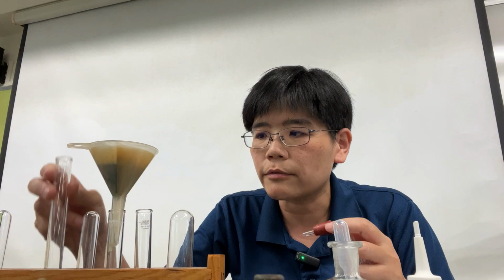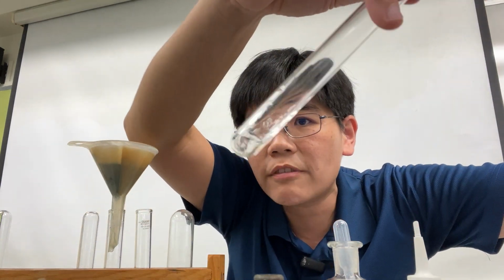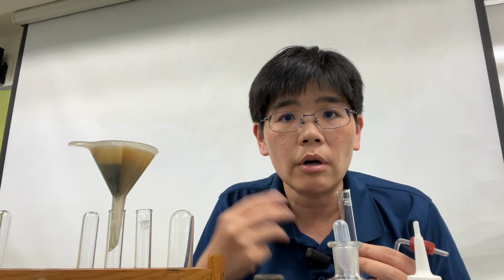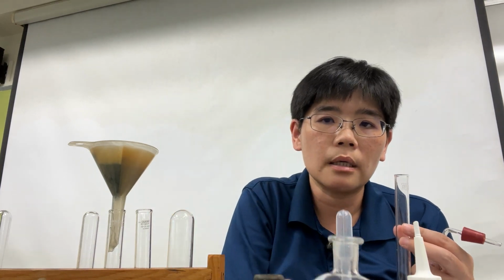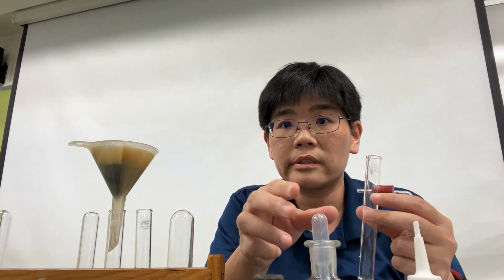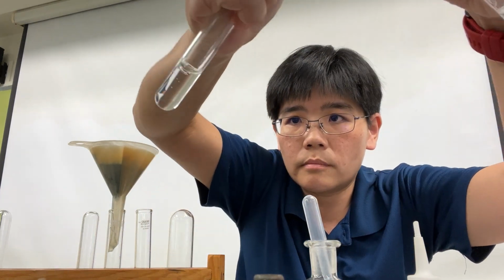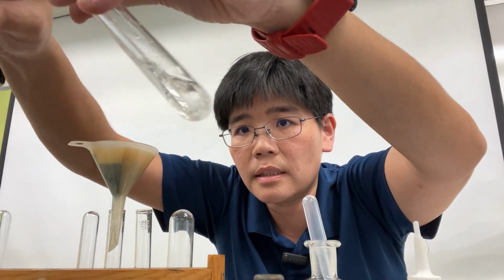Now I'm going to have to connect, but I will not connect now because there's no more effervescence. The reaction had long ended. I'm going to add more reagents and generate more of the gas and test if that gas is carbon dioxide. So I'm going to add a bit more of the sulfuric acid and be quick to connect the two tubes. Okay, so I try to mix the chemicals. There is some more effervescence.